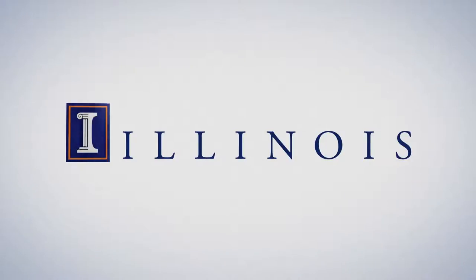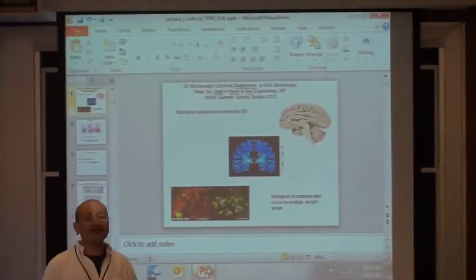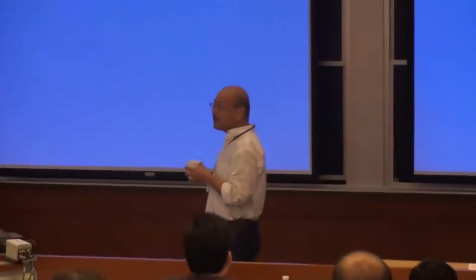Today I want to tell you, everyone has built a microscope. You guys pretty much are done. And you have seen that your microscope, although it's relatively easy to build and relatively cheap, works reasonably well. And you can image, for example, some of the dendrites of the neurons that, for example, Bill and Seb created for you, and some of you grew.